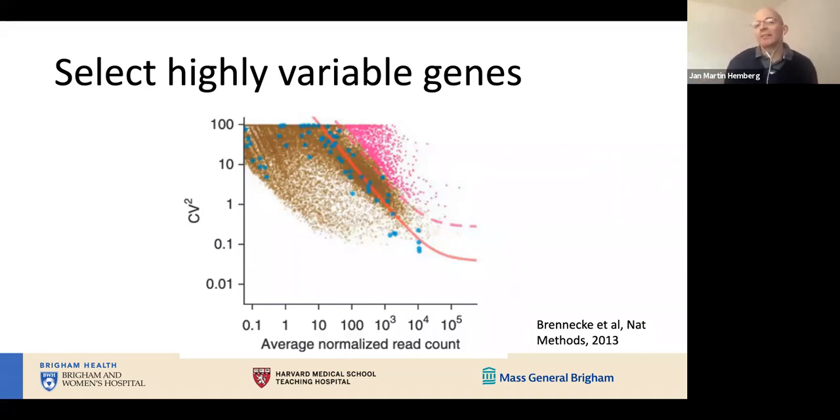These are artificial spike-ins that have been added to your sample. Spike-ins were very popular in the Jurassic era of the single-cell RNA-seq field, which would correspond to like 2014 or 2015 or so. You may have to ask a senior postdoc in your lab what they are and why they're useful, but they've really fallen out of favor these days for various reasons. Hence, I'm not really talking about them.